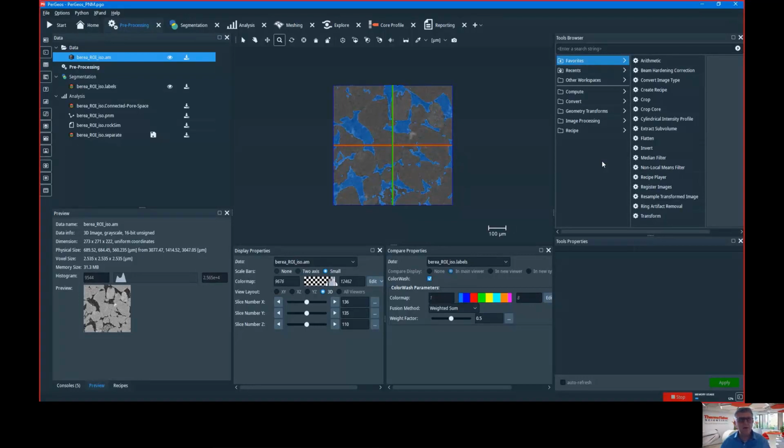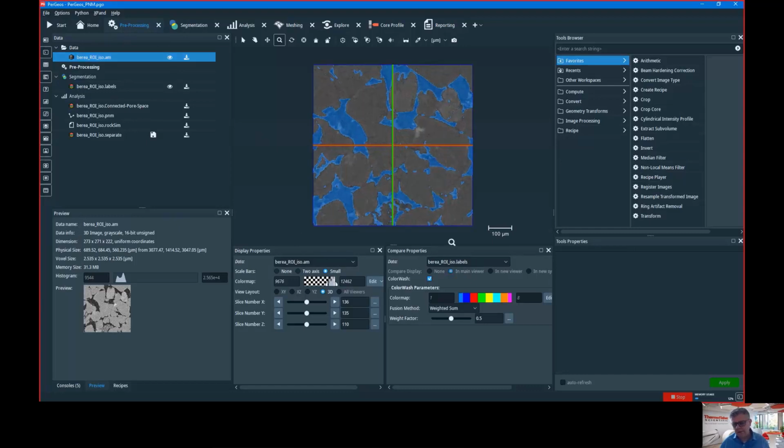Avizo doesn't guide you through a wizard, through a workflow, a path. It's a blank white area. You build your network, you do what you want. PerGeos tries to help you a little bit more with specific steps. And the other key point here, it will create visualization for you automatically, because you cannot create visualization yourself. You see, there is no network here.